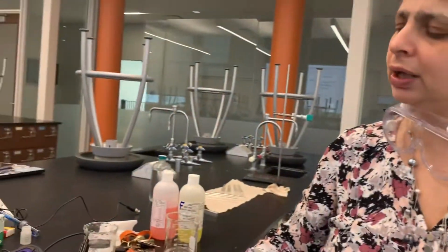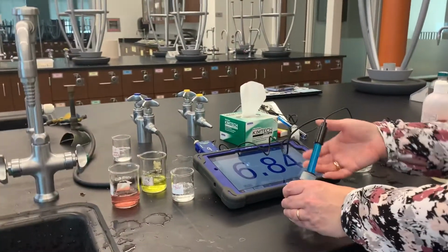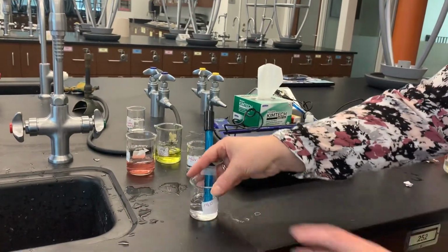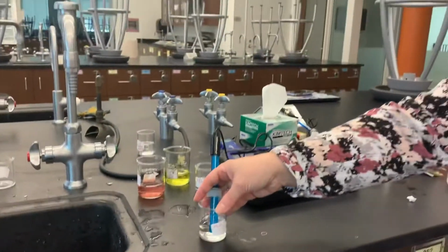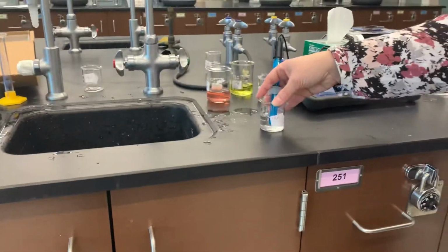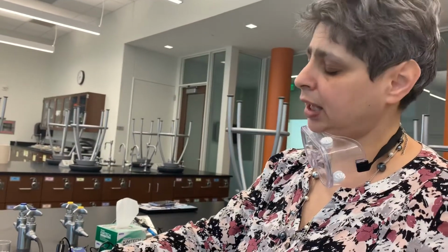Okay guys, I fixed, I hope, all my issues. Well, not my issues, but issues of this setup. I replaced the sensor. So what I'm showing you right now is just pure water. Nothing added to it yet. Just water. So when you look at your data sheet, there will be an entry there. It says beaker with pure water, and theoretical pH would of course be 7.